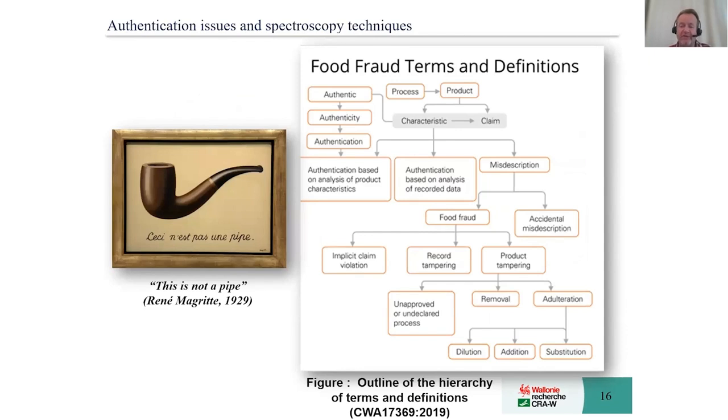And untargeted detection is very important in fraud. You know that in food there is more and more concern about different problems in terms of mislabeling, of adulteration, of different problems. And so we have to be able to check a larger portion of the samples, not only to check in the lab, but also to check in the factories, in the retailers, and so on. And this is something that we have been doing for years in our institute.